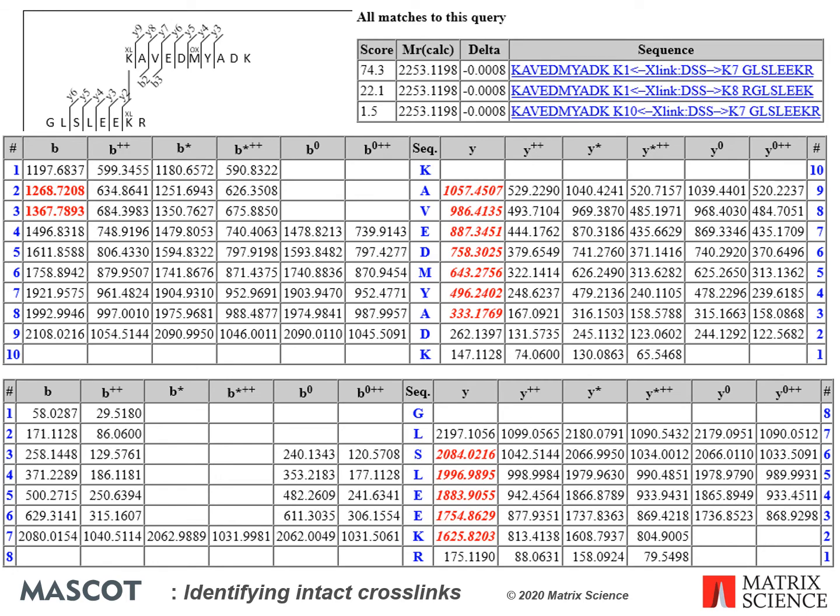At the bottom of the page, you can see the query also matches a slightly different beta peptide. However, the rank 2 score is much lower, and there is no ambiguity in the alpha peptide, so we can be confident the top match is the correct match.